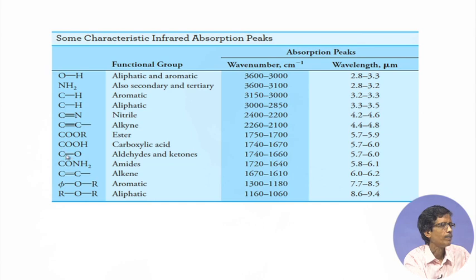So, we can have this group for carboxylic acid as well as amide, but there is a change. Now it is not the group making it a carbonyl or aldehyde, but you can consider a change where you have the CO function with the attachment of the OH.